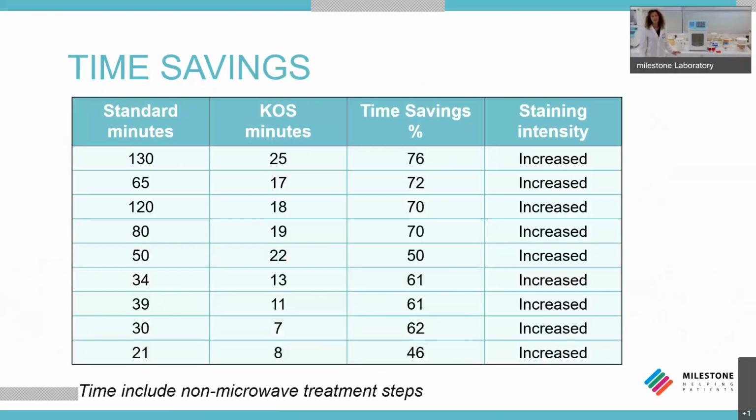When doing special stain, time is of course an important aspect. Several time-consuming staining procedures are enhanced by microwave irradiation, as shown in this table.